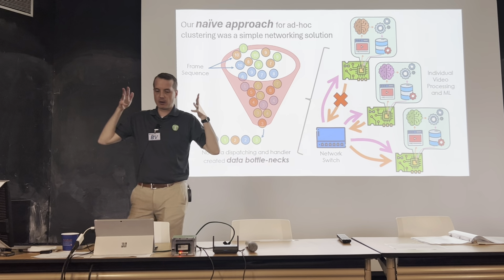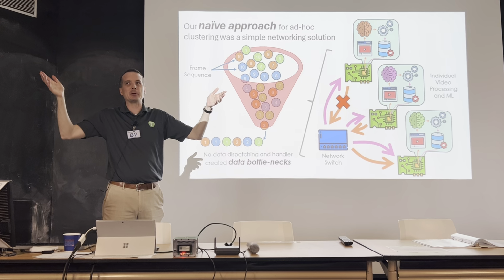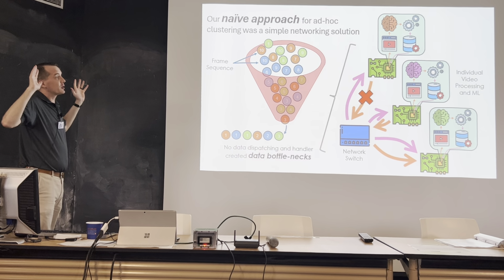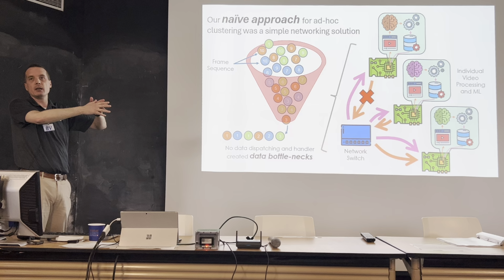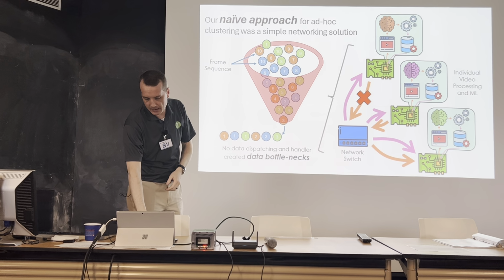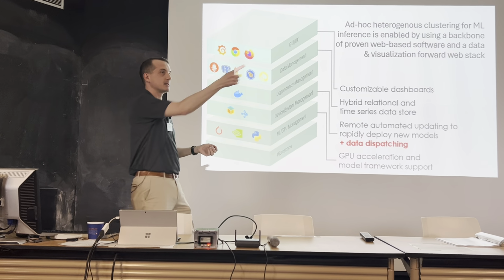And that's because we're also doing the full screen image of the monitor, so it was also resolution dependent on your monitor. They'd upgraded their monitors because microscopists love high definition video. So we were trying to shove that across the network 3 times over, right? We're essentially streaming Netflix 3 times across this poor little device over here. So we had to come up with a better way to do that. In retrospect, we probably should have known that was going to happen when we started, but yes.